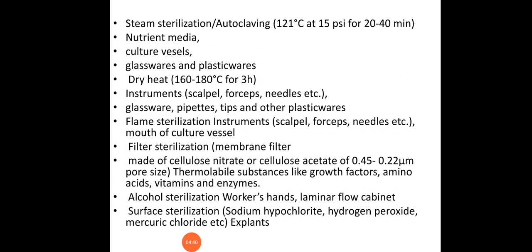Alcohol sterilization. So in alcohol sterilization, the plant tissue culture technician, before entering the lab, first sterilizes themselves with the help of sanitizers or sterilant. Then only can the samples survive.